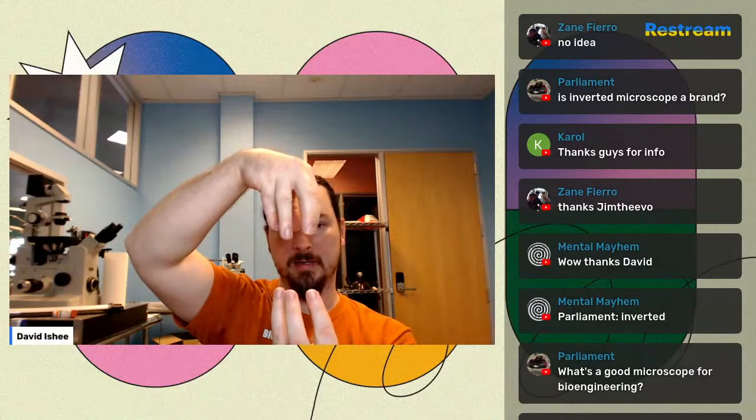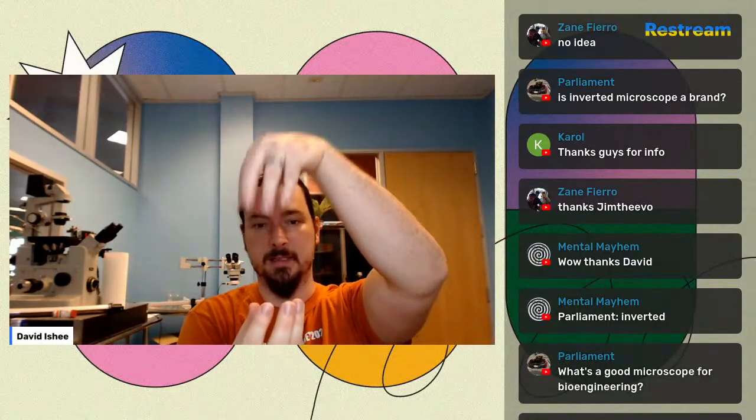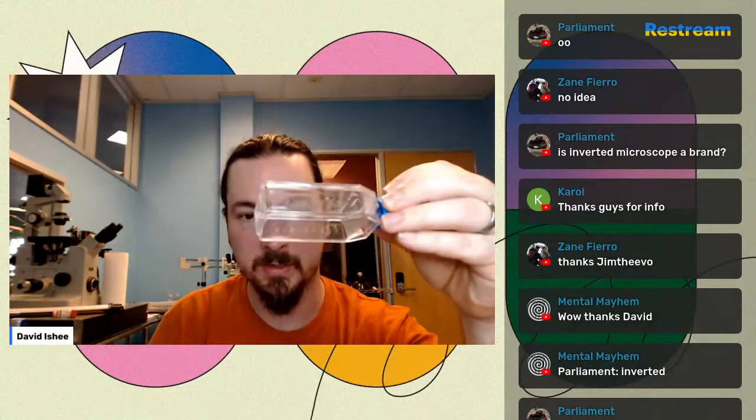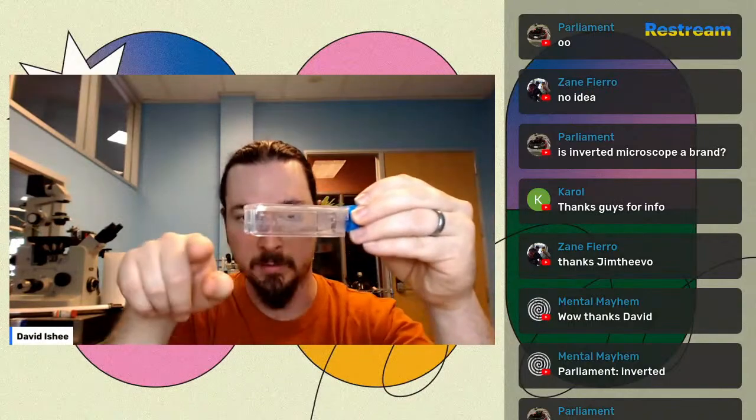Inverted microscope is not a brand, it's a type of microscope. So normally microscopes have the optics at the top and the light at the bottom, but inverted is light at the top, optics at the bottom. So instead of looking at the top of your sample, you're looking at the bottom of your sample. And that's good for things where, if you have a flask of human cells and they're all stuck to the bottom, growing along the bottom as a sheet of sort of skin almost, you can look at them easily through the bottom.